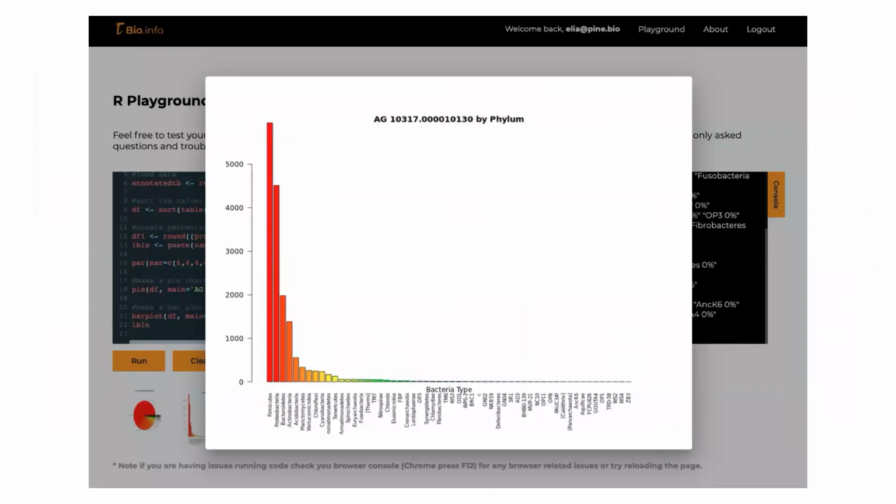So last time we briefly saw how you can produce a bar chart for just one patient or one participant to understand the composition of that participant's bacteria. And we saw Firmicutes were abundant, Proteobacteria and Bacteroidetes. So we saw the major three that we've seen up until now.